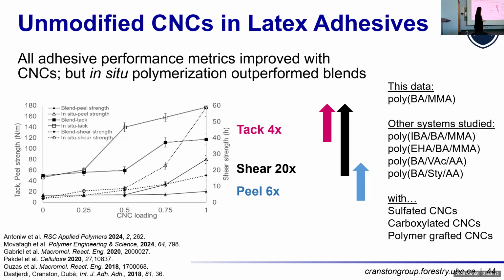And we've seen this behavior across lots of different monomers and polymers and with different kinds of cellulose nanocrystals, essentially where these top ones here are commercially available. So that was good to move forward. But honestly, we didn't know why. And I kept saying, why is this happening? And they kept saying, look at the data, it's happening. And like, I know, but why? I'm like, oh, because it's improving it. And this shouldn't happen, but it does.